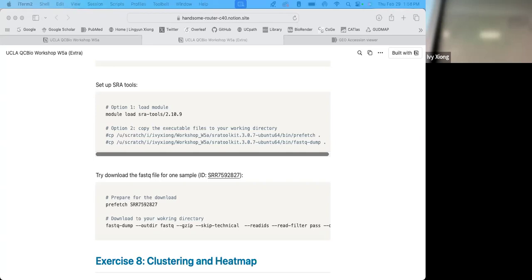So this is for sure. So here's an internet. She said we don't have to mess with that one, just like that. If you press that, you did the module load, that worked very well, right? Just took out that, we do this. Oh, next bit.